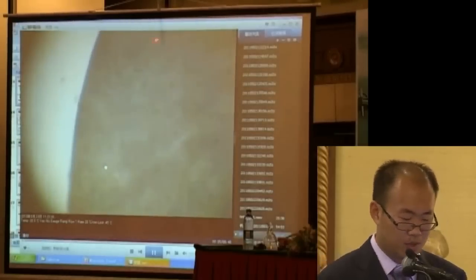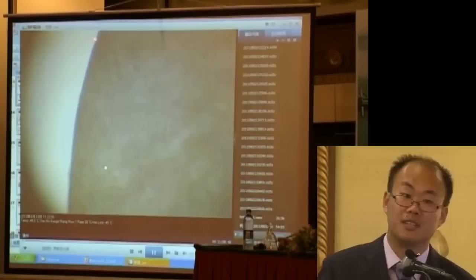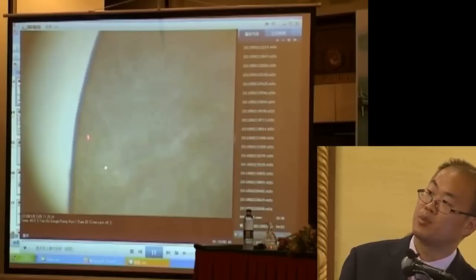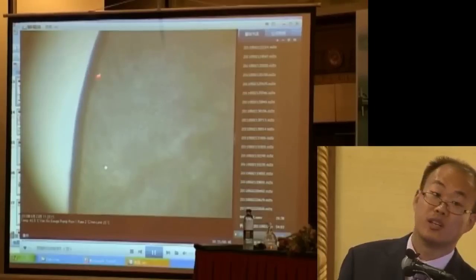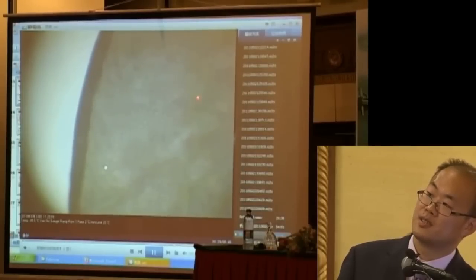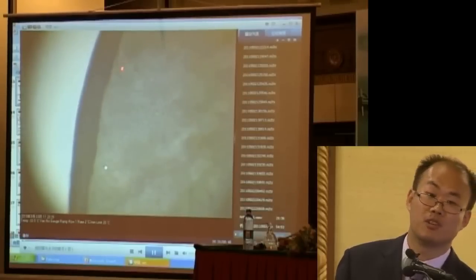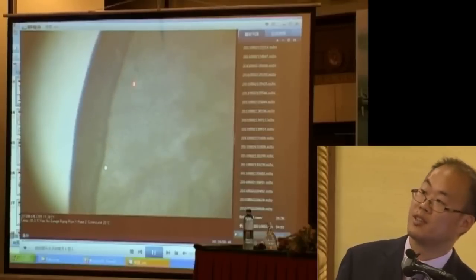Now let's see a video. Now we decrease the temperature. At some point it becomes solid, just white to black. Now the border is a dried layer. We increase the temperature. As time goes on, the dried layer becomes larger, and the sublimation front goes from left to right. We increase the temperature.